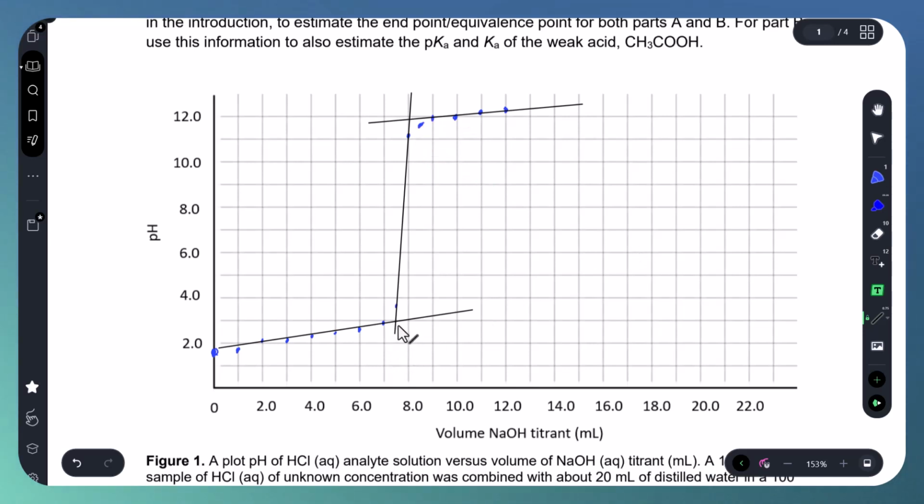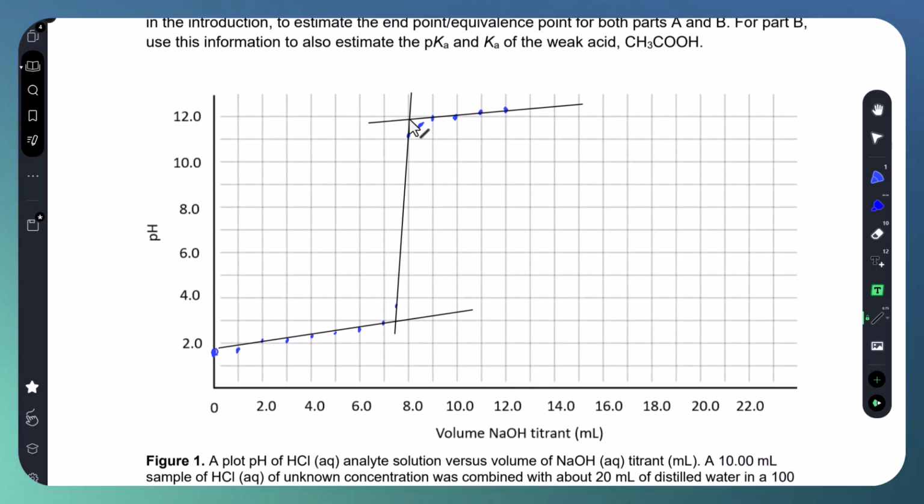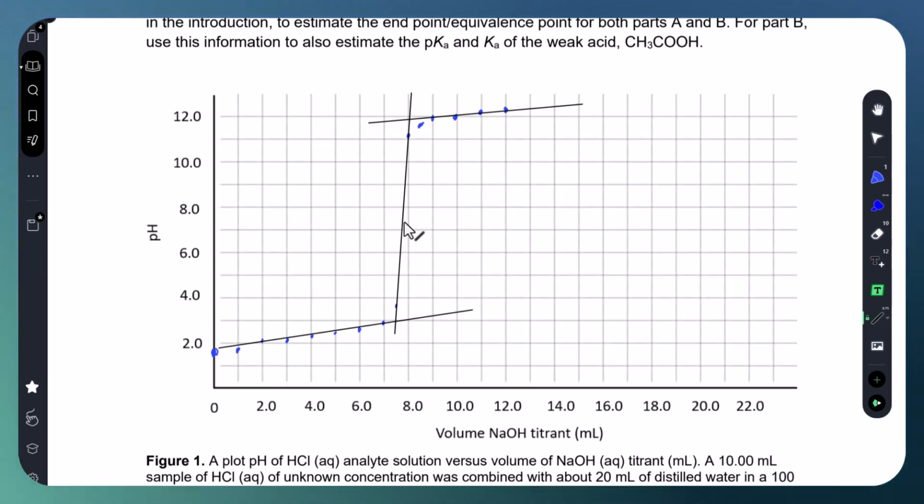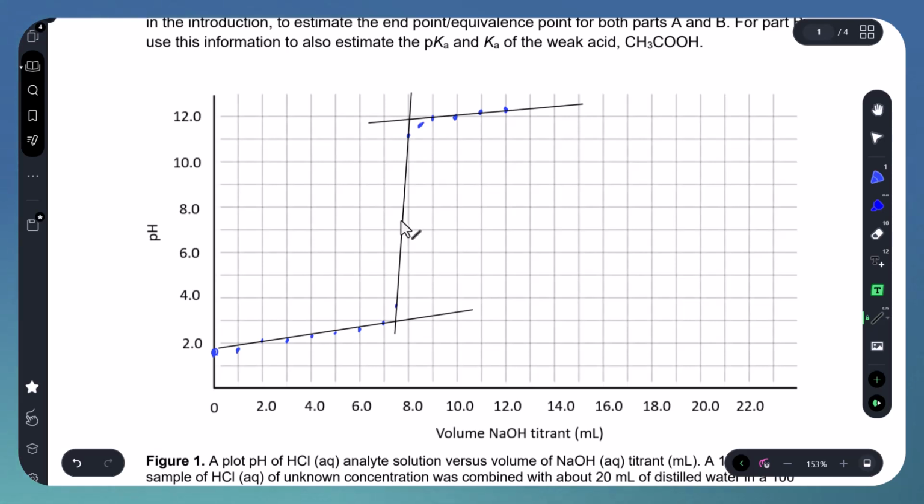And so it is helpful to look at the graph and say, okay, we're at roughly a pH of 3 here, and up here we're at a pH of 11.8. So I'm certainly guesstimating here a bit. So we go from 3 up to 11.8. And so the difference here is 3 to 10, that would be 7, and that would be 8. So 8.8. So we're looking for a difference in pH of 4.4, starting down at the 3. So that would bring us to about 7.4, which is actually pretty close to a pH of 7, which is what you would expect the pH to be at the equivalence point of a strong acid, strong base titration. So we're going to try to draw another line that intersects at around a pH of 7.4 here.